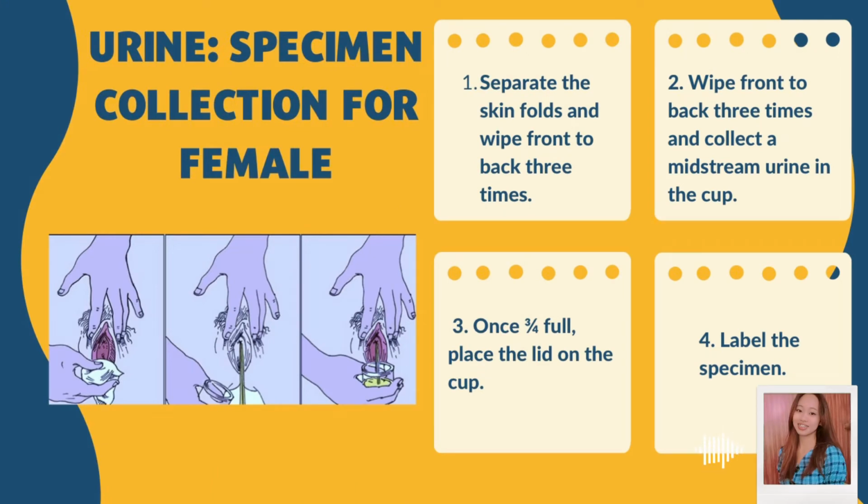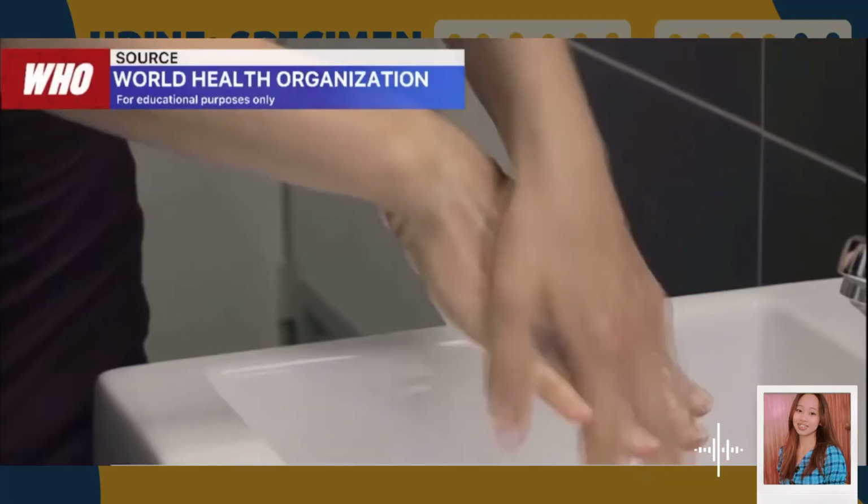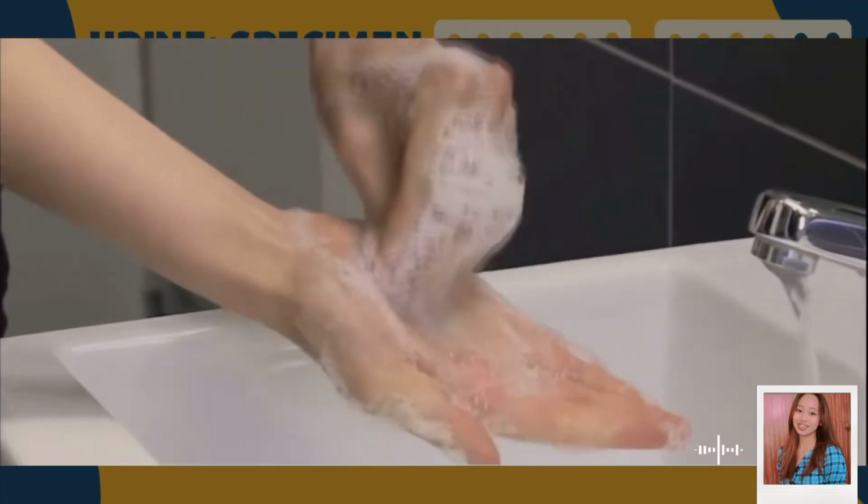Ang pagkuha ng sample galing sa ihi ay isa sa mga pinakamadaling kunin na sample dahil hindi na ito kailangang kunin mismo sa loob ng katawan ng pasyente. Least invasive. Malagang kunin ang proseso ng clean catch upang magkaroon ng insaktong resulta galing sa hindi kontaminadong sample. This instruction may vary slightly with different manufacturers.